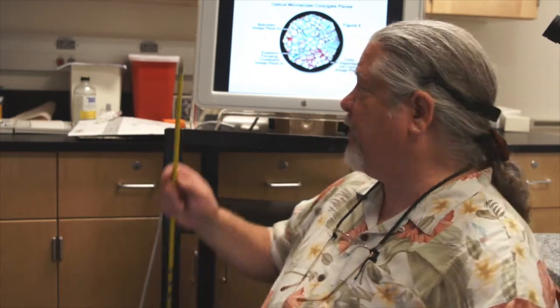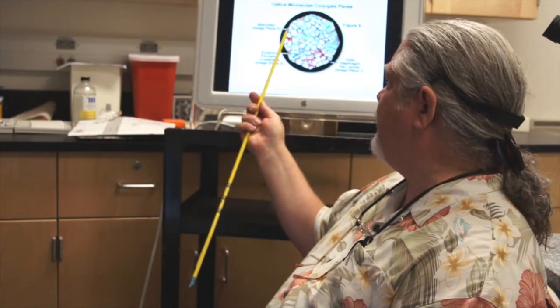Then you raise and lower your condenser until these leaves become nice and sharp. Once the leaves are sharp, based on the height of the condenser, you use alignment knobs on the condenser to align that diaphragm to the field of view. Once it is perfectly aligned to the field of view, you open the diaphragm just outside the field of view and now your optical path is aligned with your light path.